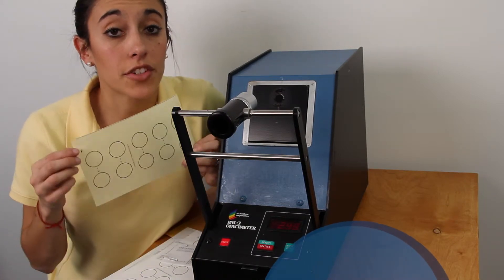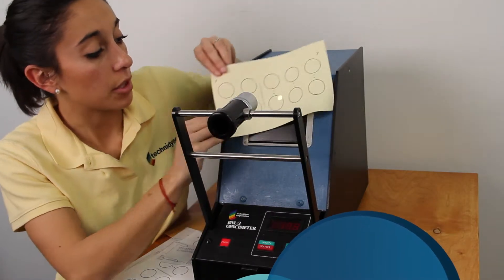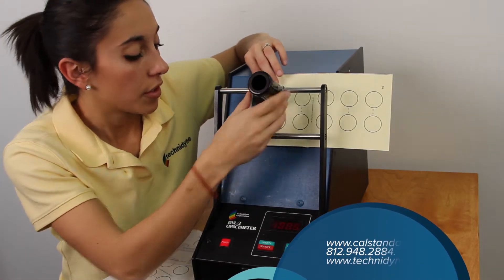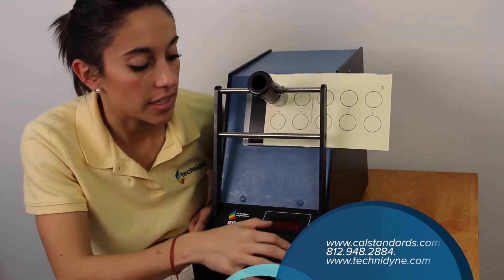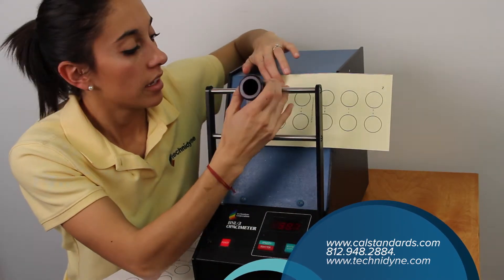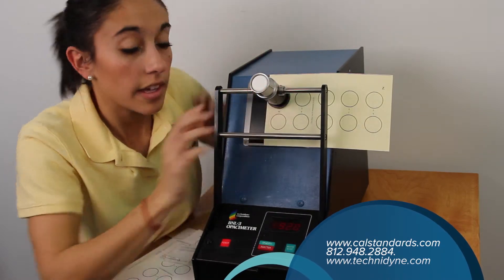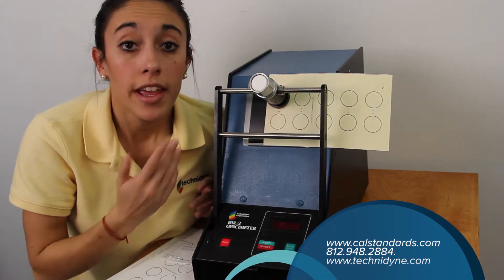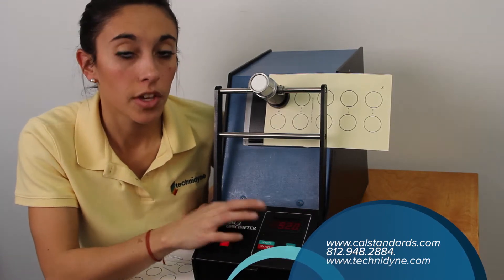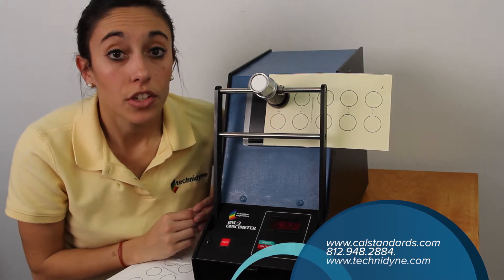You'll notice that each of the paper standards has circles numbered 1 through 10 on them. Take the first one and load circle number 1 so that it's centered over the light, then load your white body. Hold down the white body button until the number reads 100, then rotate the backing body until the black body is down. If your instrument is equipped with a printer, it'll store the data for you; if not, you'll need to write this number down. Repeat those steps for numbers 2 through 10, and at the end you'll have an average.